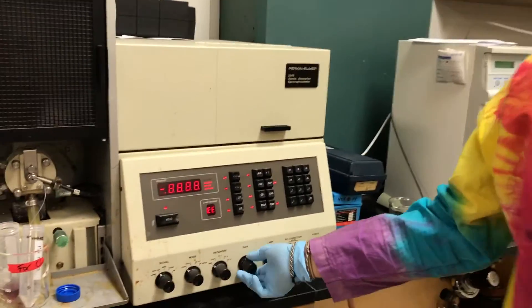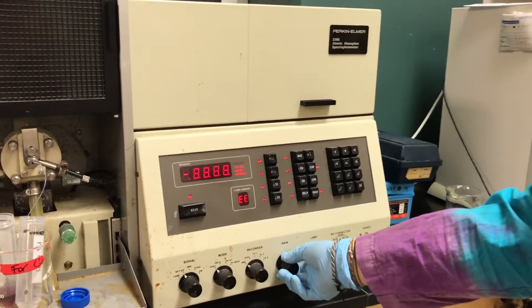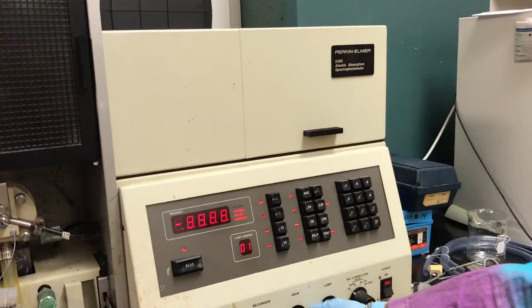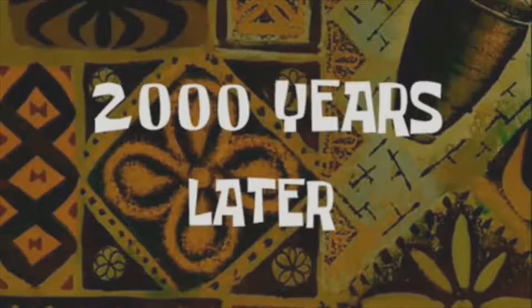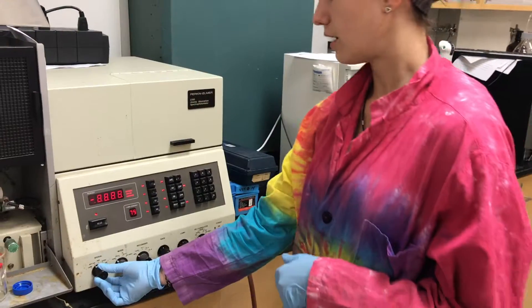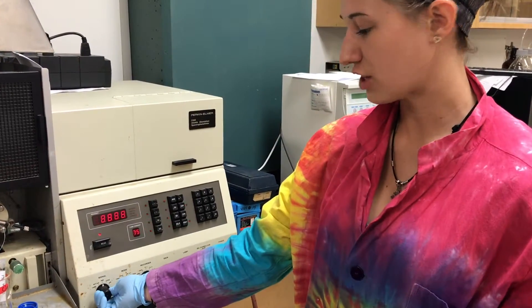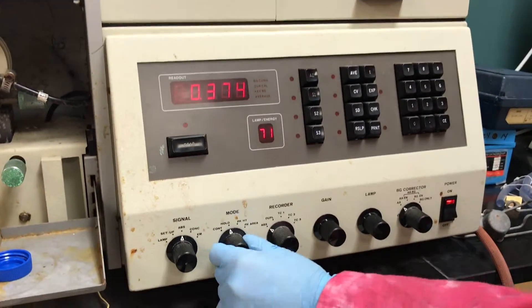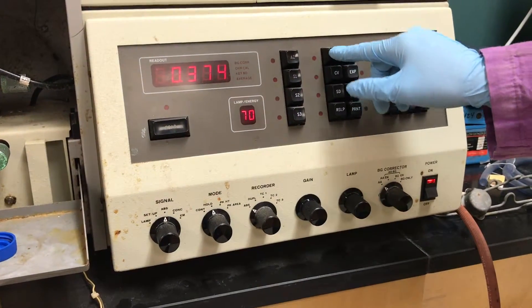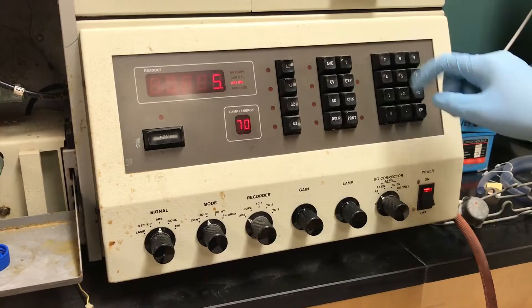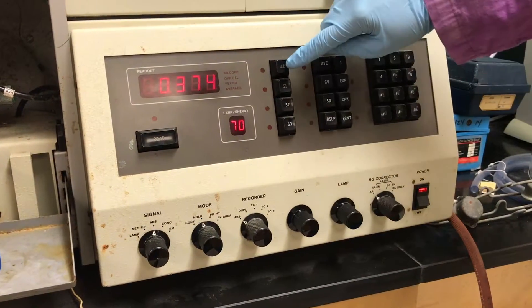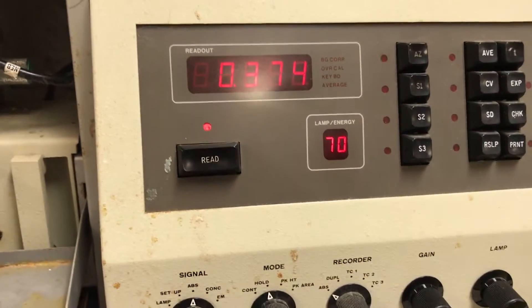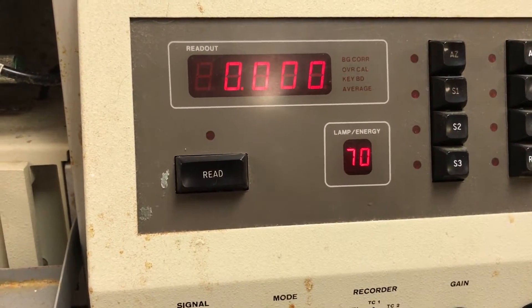Then, you adjust the gain to 75. Two thousand years later. Now, we're going to zero the instrument. Change signal to absorbance. Change the mode to hold. And click average, five, T, AZ. This will take the average over a five second time frame to zero out the instrument. Like that.